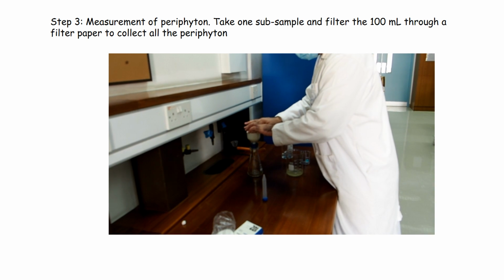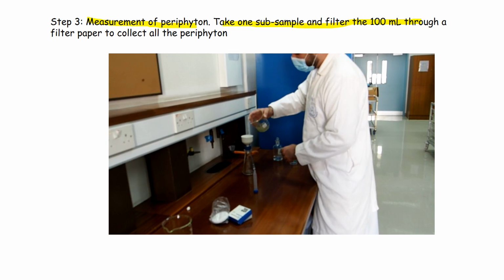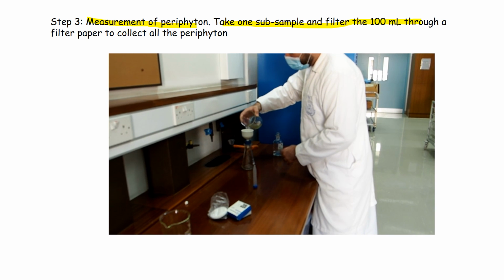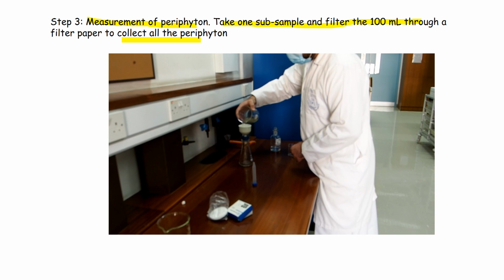For measurement of periphyton, take one subsample and filter it through filter paper to collect the periphyton.